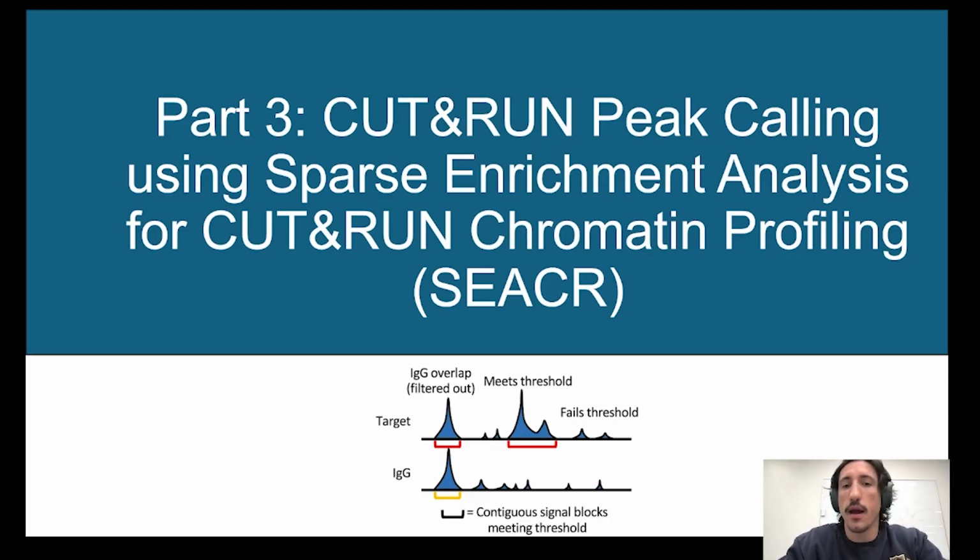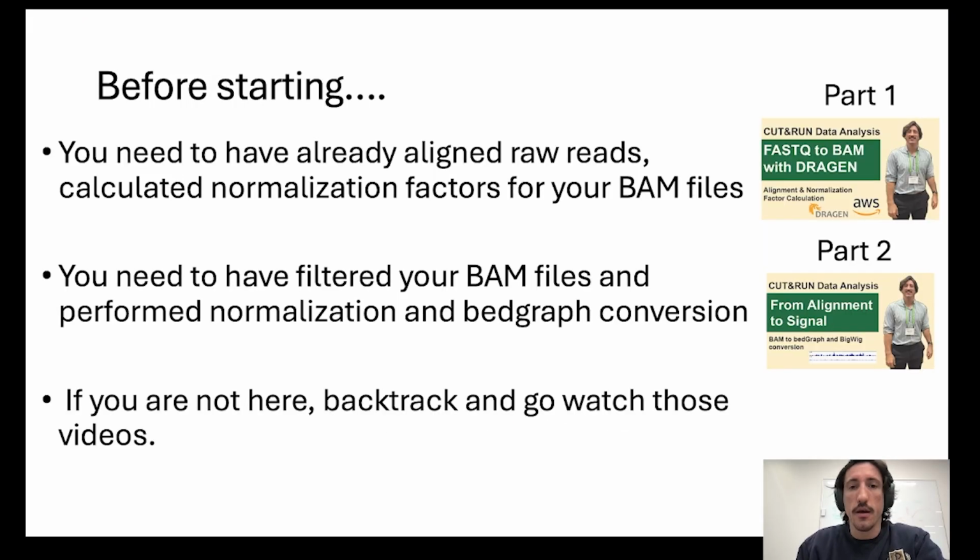Today, we're going to be looking at part three of the cut and run data analysis series, and we're going to be focused on performing peak calling on your cut and run sequencing data. If you've processed and aligned your cut and run data, but you're struggling to figure out how to call peaks, you are in the right place. Today, we're going to be focusing on a software called SEACR to perform our peak calling.